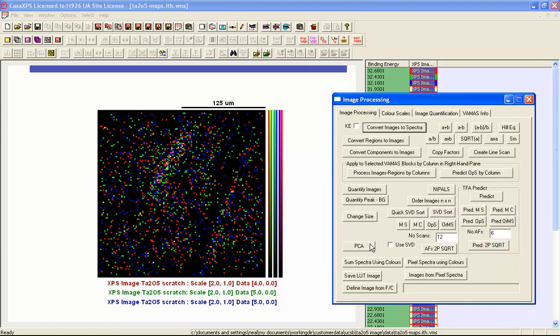Now in the first instance, we should first of all demonstrate that this data set contains the type of signal to noise that would be perfectly acceptable for any type of spectroscopy analysis. And we can do that by simply summing all of these images into data bins corresponding to a single spectrum. So there are a set of energies, one for each image, and if we just treat each image as if it is a detector and sum all the intensity from that image into a single bin, then we end up with a spectrum.